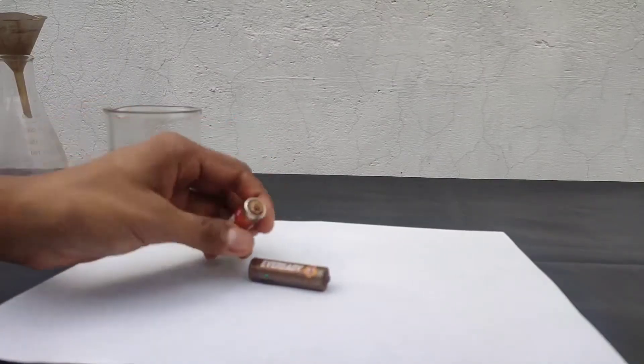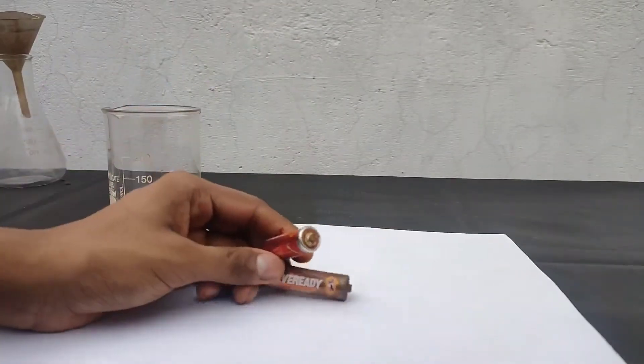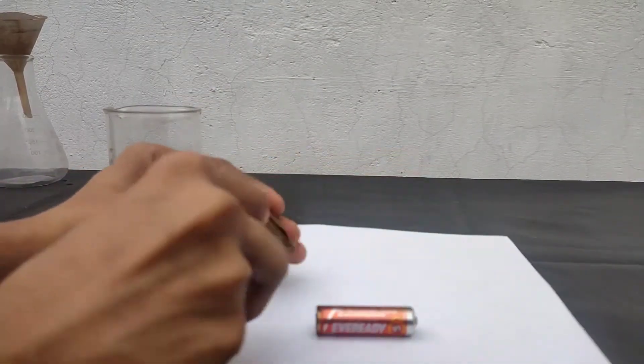In this video, I will be making manganese sulphate from these dead old batteries. So these are two dead dry cells, and I will open them up.